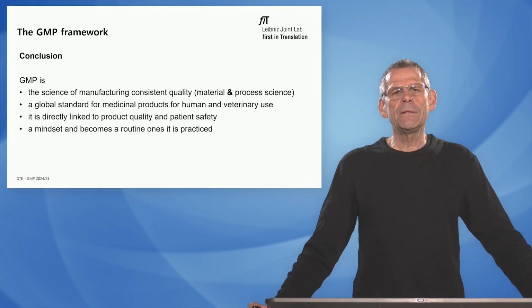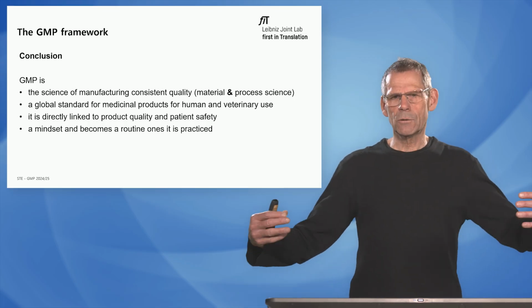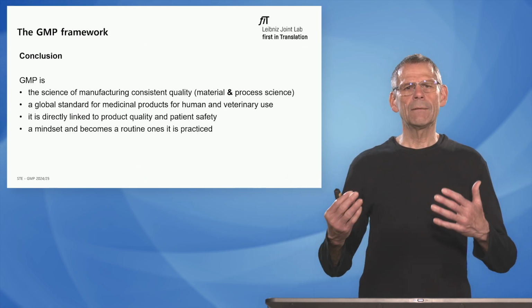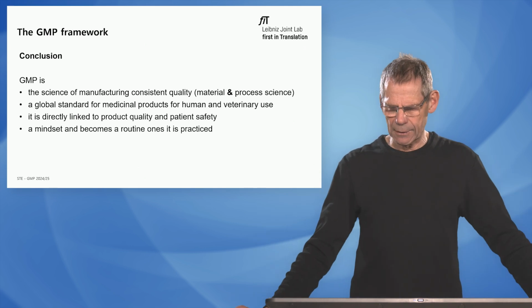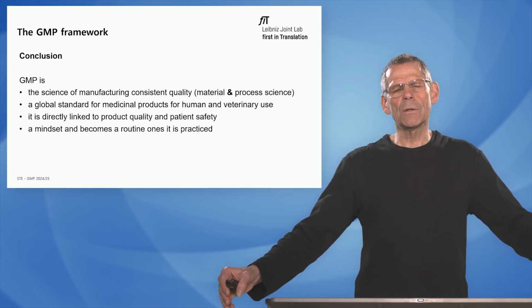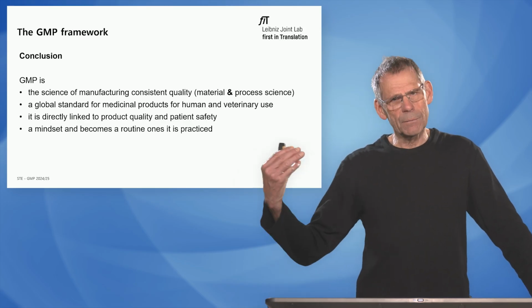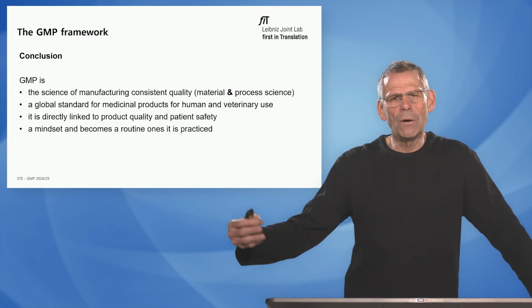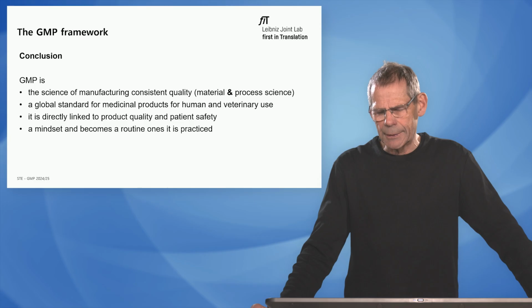And honestly, it's a mindset that becomes a routine once you start to practice it, because it helps us understand how we operate and our influence, and the quality of the manufacturing can be guaranteed by this guidance and this behavior that you learn once you are in a GMP environment.